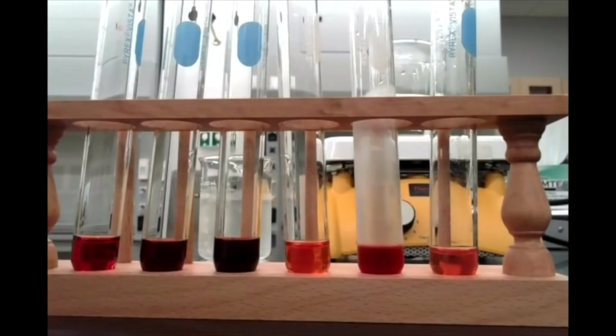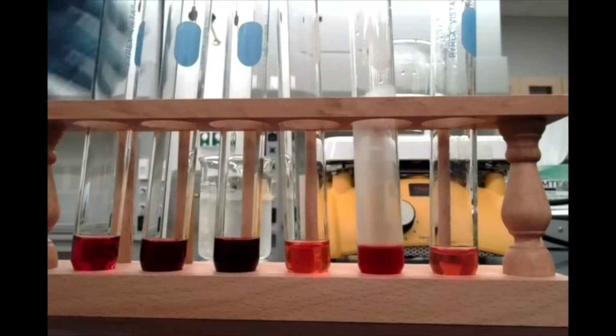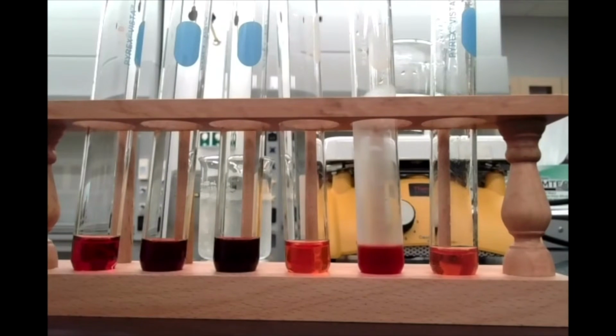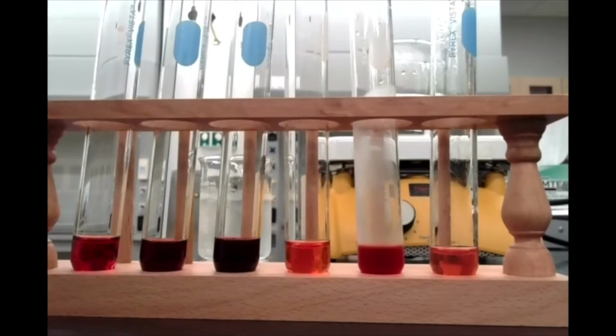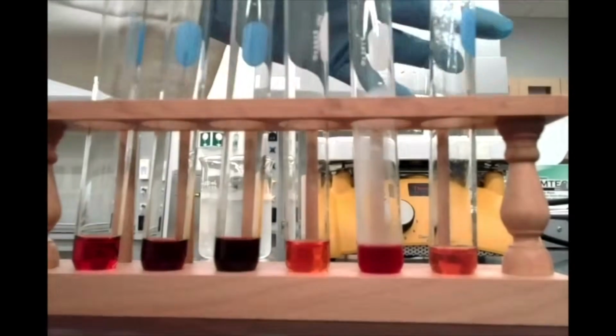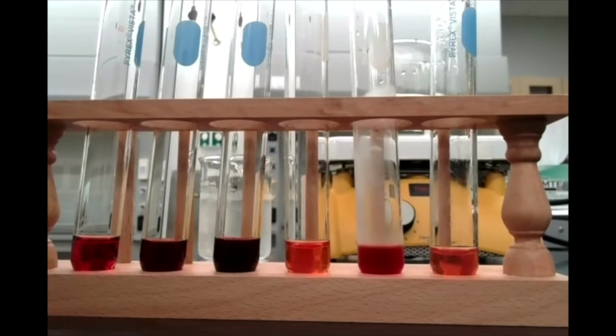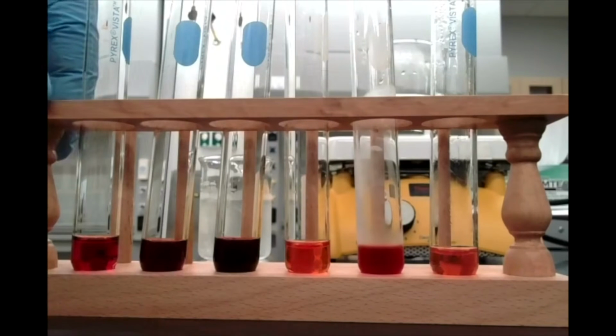Alright, so here are all 6 of our test tubes shown once again. And if you want to compare with our reference, you can see how each of our test tubes have changed color accordingly. And again, with the last two, it's a little subtle in terms of that difference. But hopefully, lined up next to the reference and perhaps one of the other test tubes, you should be able to figure out what's happened in test tubes 5 and 6.